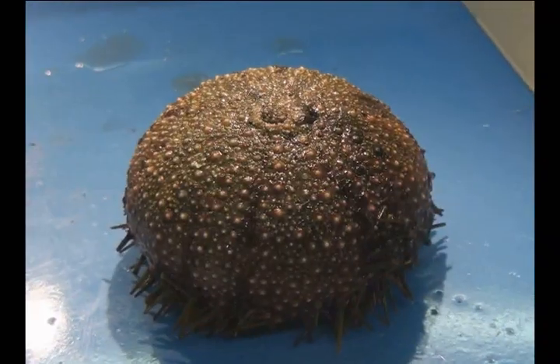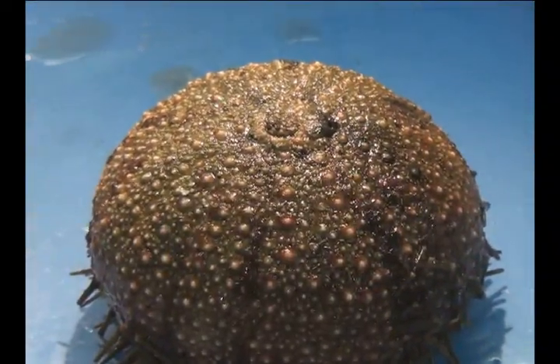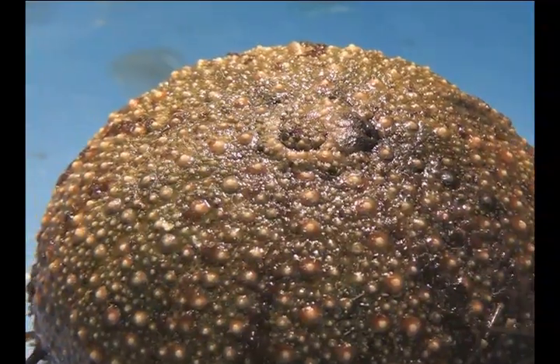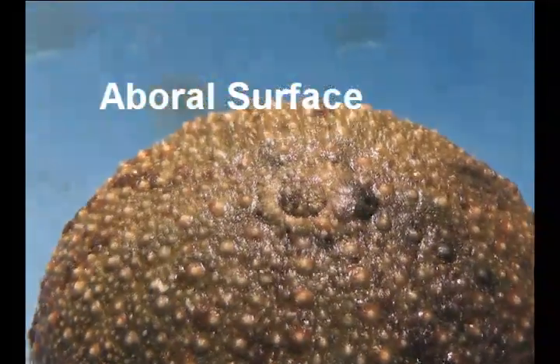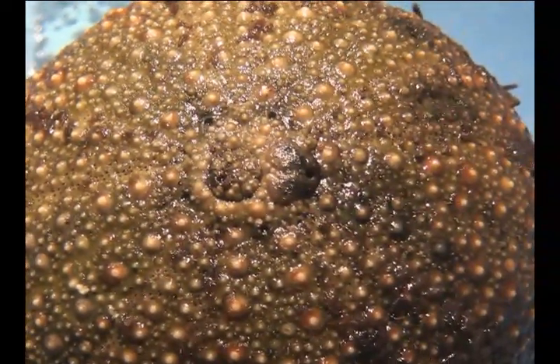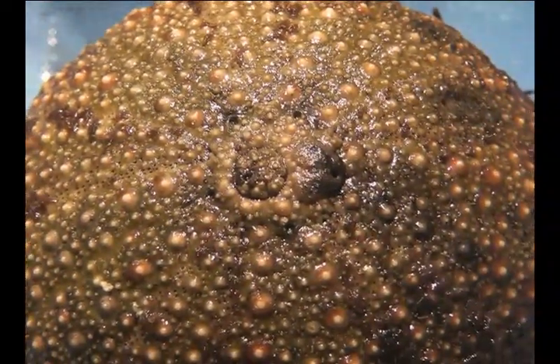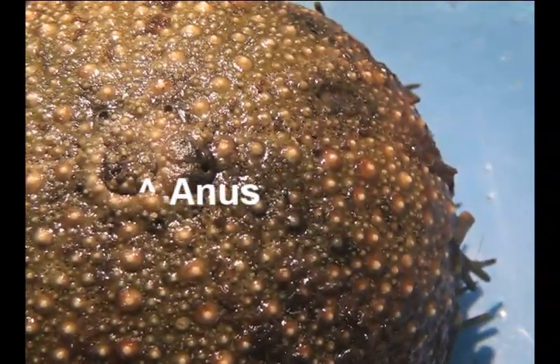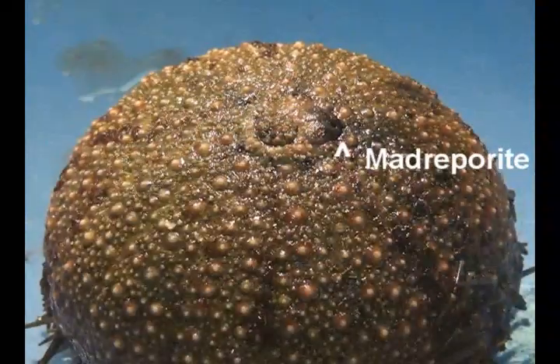Alright kids, now it's time to dissect your sea urchin. Let's start by identifying some features that are on the top, or the aboral surface. Located right at the center, you can see a nice round anus. And just to the right of the anus, you can see a beautiful madriporite.